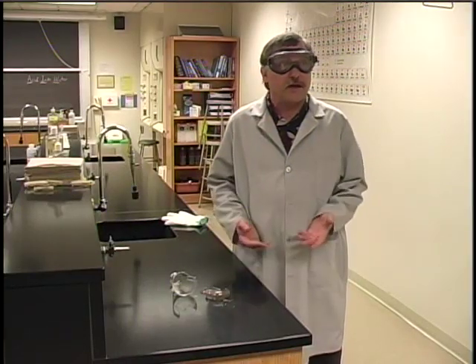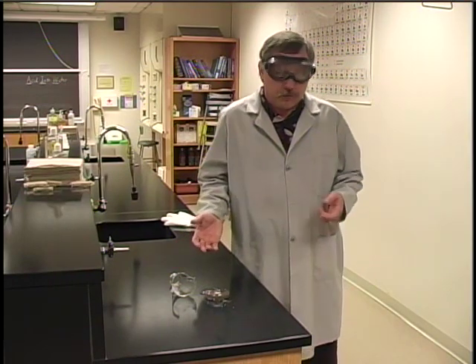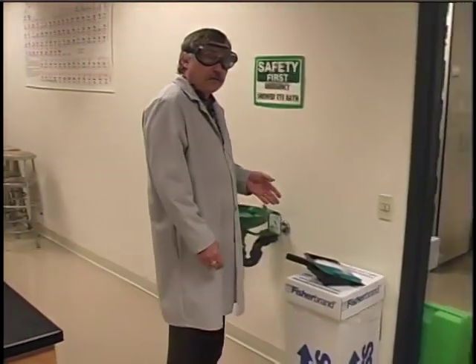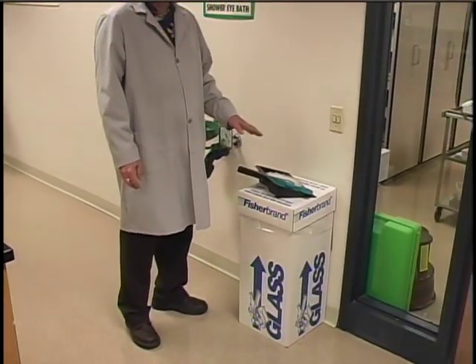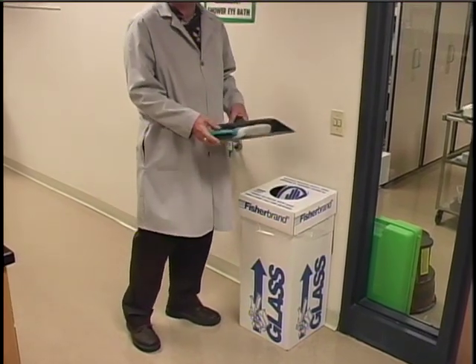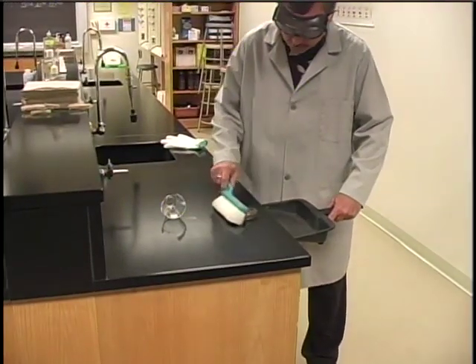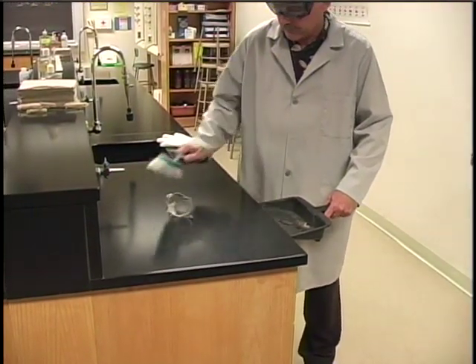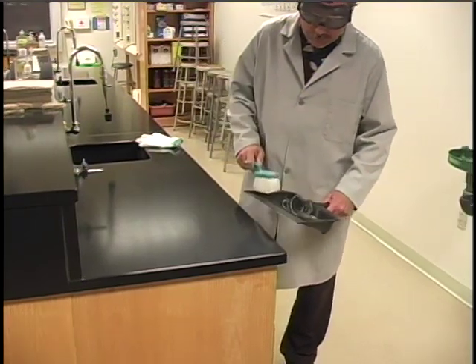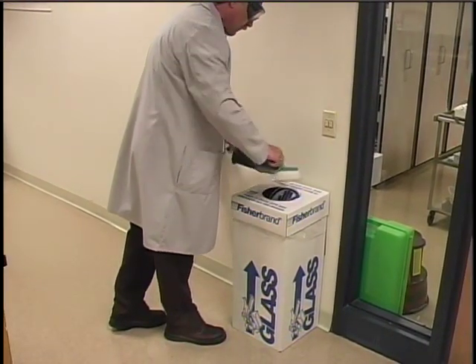The most common laboratory accident we have is broken glass. Broken glass should never be disposed of in the trash. We have a special box in the lab for broken glass — notice where it is. On top of that box is a broom and dustpan; use these to pick up the broken glass, wash your hands, and dispose of the glass in the box.